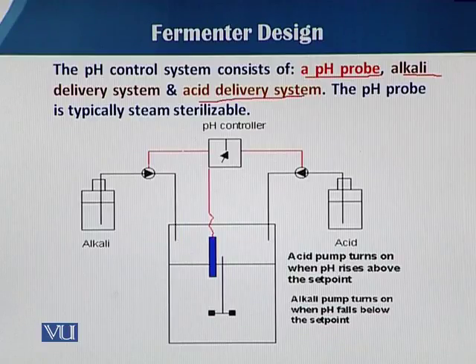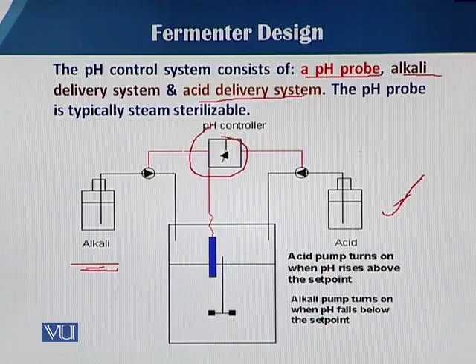The pH probe senses the actual pH inside the fermenter, and then signals either pump 1 or pump 2. Pump 1 is attached to the alkali and pump 2 is attached to the acid. So there is an alkali delivery system and an acid delivery system. Here you can see on the left side the alkali, and on this side the acid, and here is the pH controller, and this one is a pH probe.